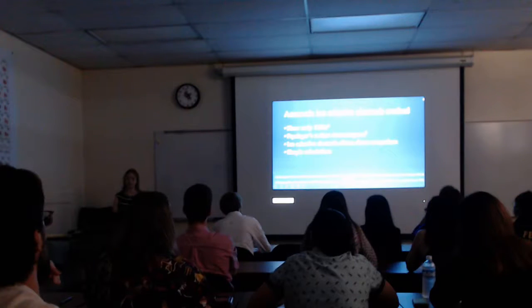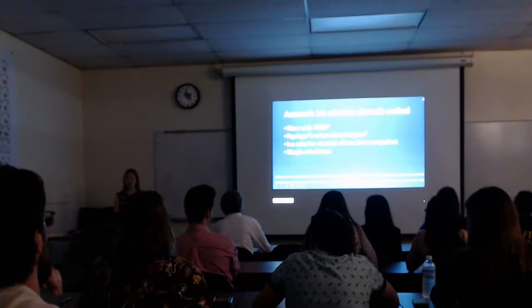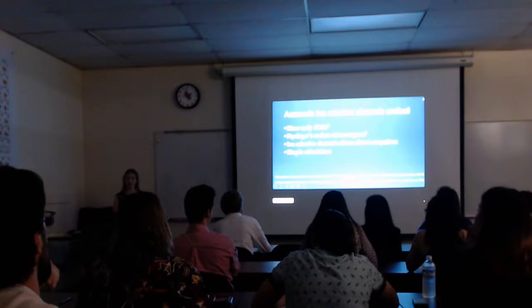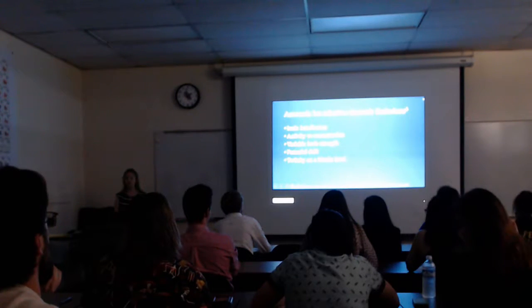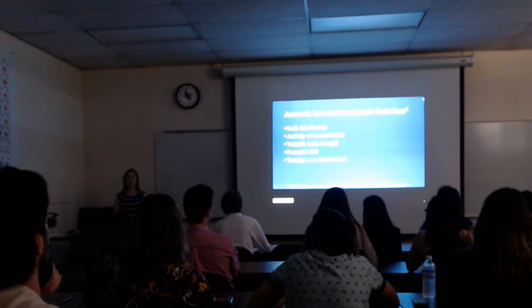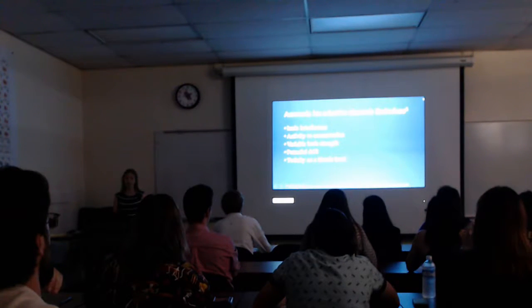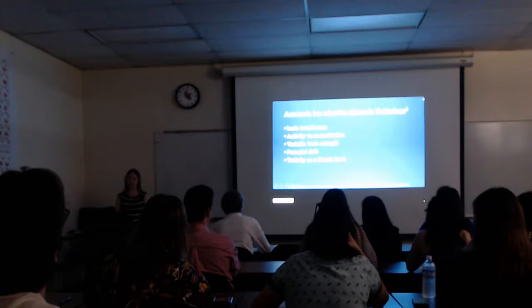The ion selective electrode that we used, the ammonia gas ion selective electrode, allowed for a more direct comparison and more simple calculations. There are limitations associated with this method, of course. Given that it is an ion selective electrode, there are ionic interferences. The ammonia gas selective electrode was chosen because it had fewer interferences than a potassium or sodium selective electrode.